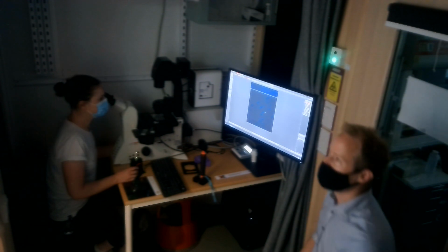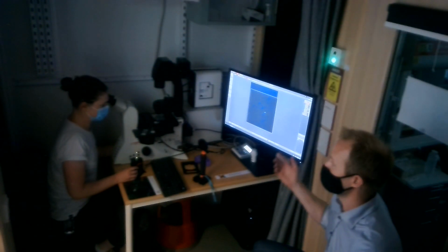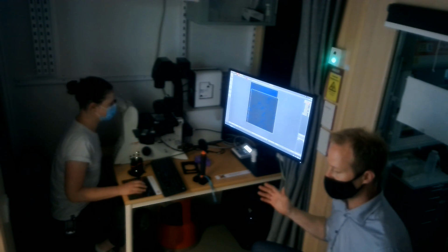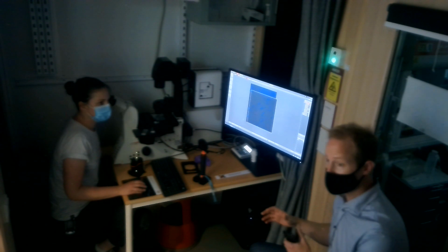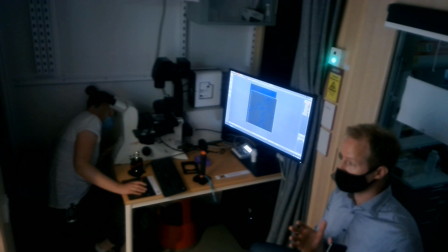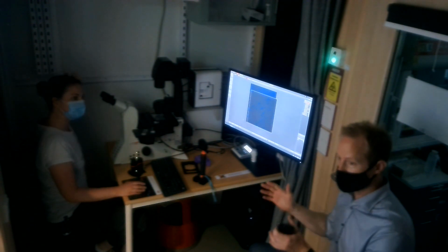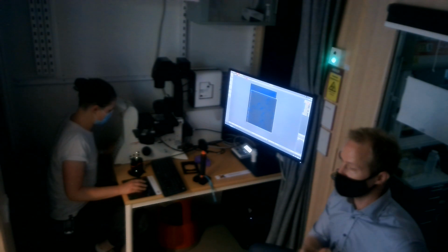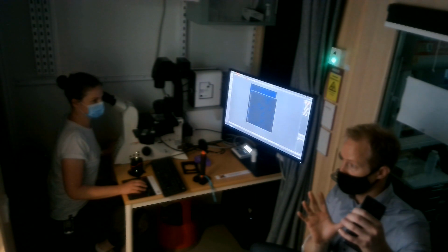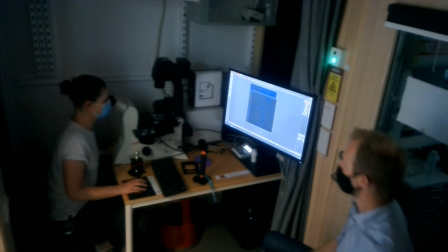And this thing with this type of camera that we have here that has such a wide dynamic range is also very beneficial for doing these kind of experiments, because if you are expecting to measure a series of samples where you have some very bright signals and some fairly dim signals, if you have a camera with a pretty bad dynamic range, you might be able to capture the very bright ones, but the dark ones will be too dark. Or you can capture the dark ones by having longer exposure time, but then the bright ones will be overexposed. With a camera like this, you have a better possibility to actually capture both and have enough information both in the high end of the intensities as in the low end to be able to quantify everything and get more data.